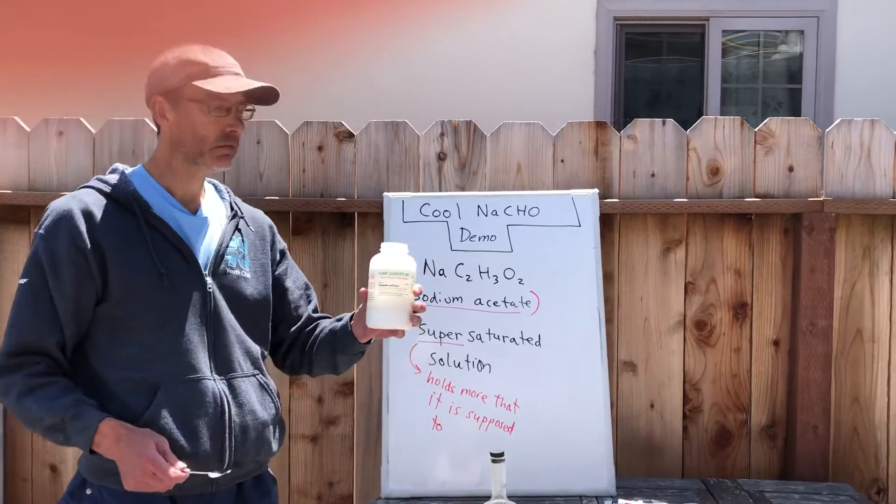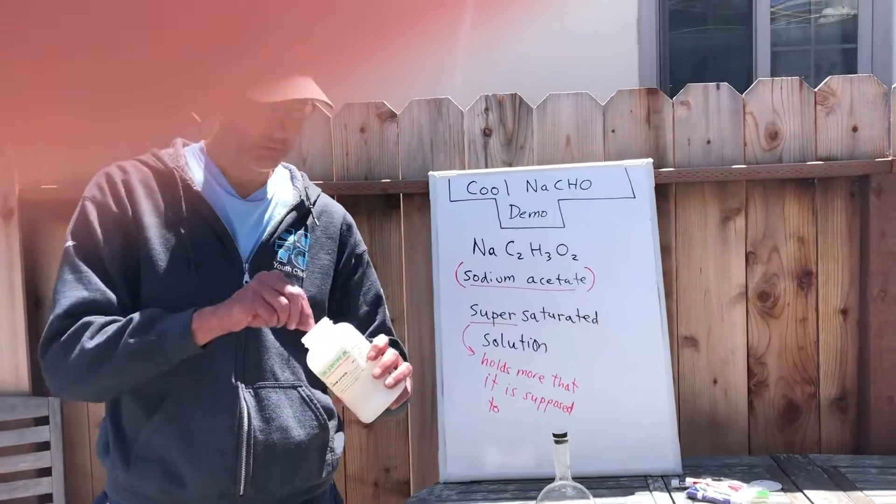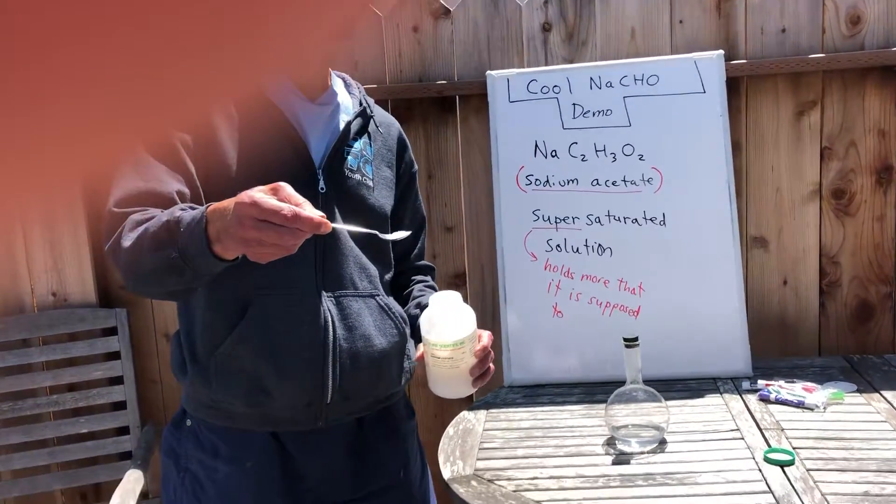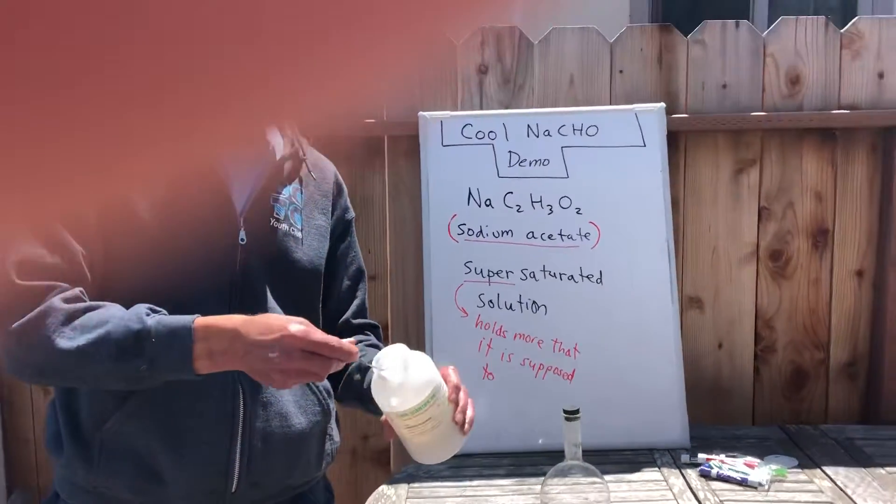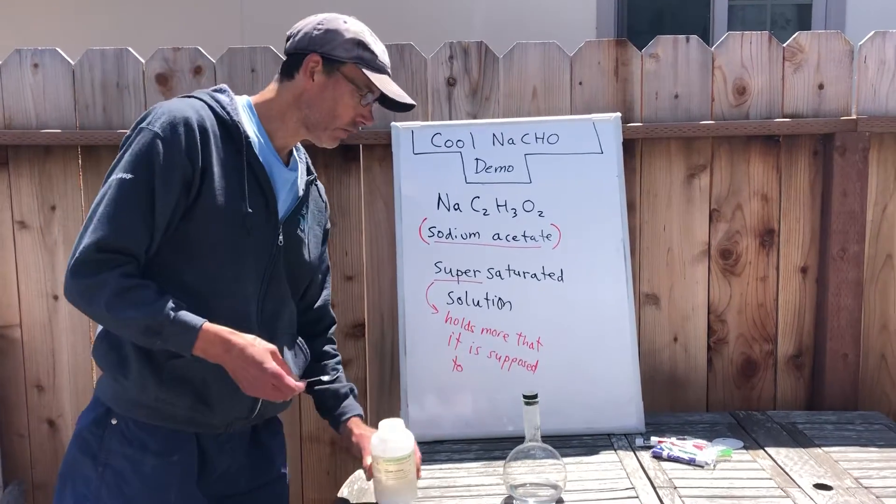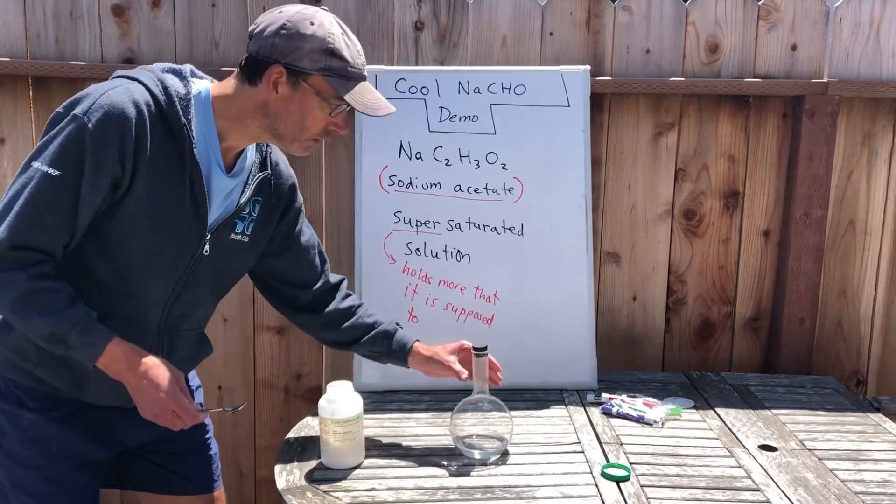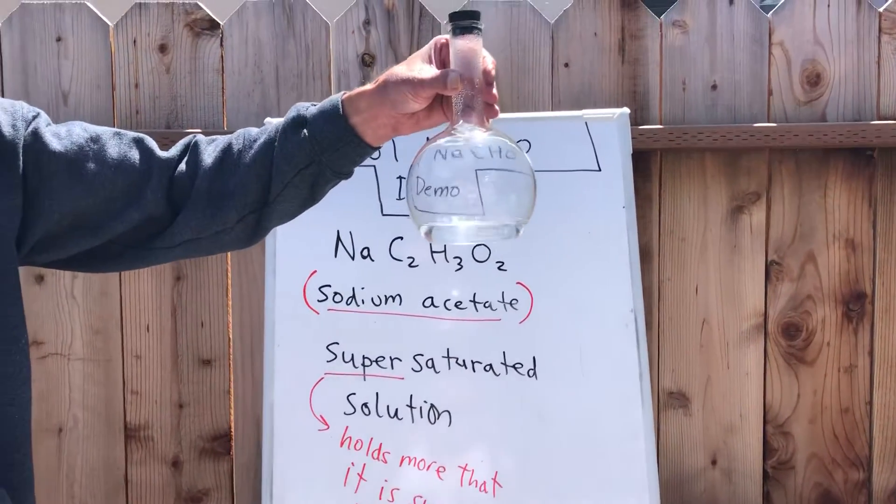What I've done is taken some sodium acetate, which is just the white salt. Looks just like regular salt. I have a supersaturated solution of sodium acetate in this flask.